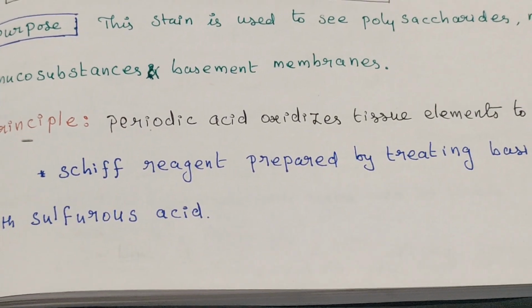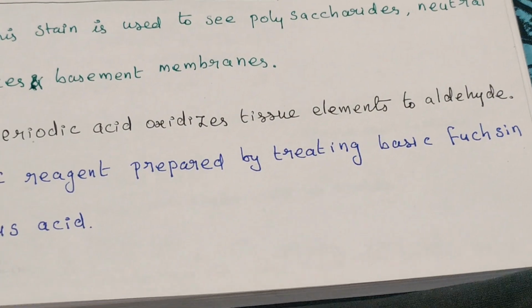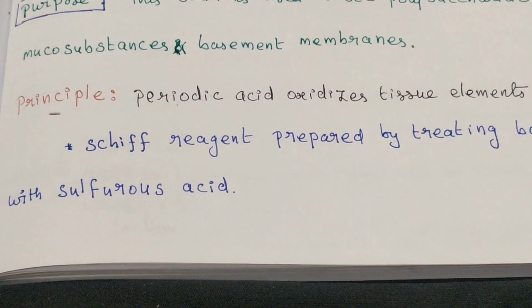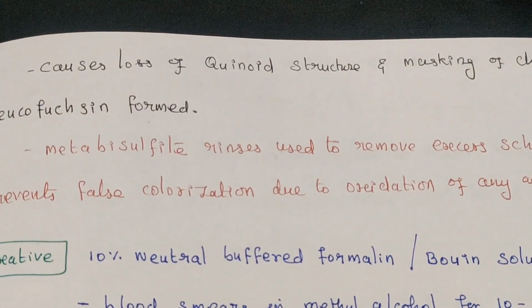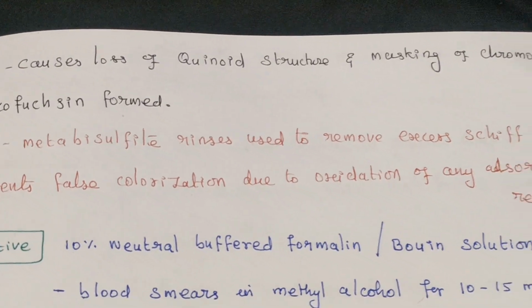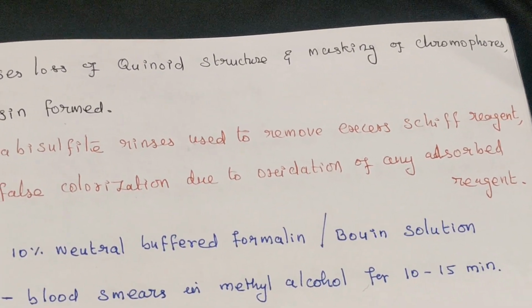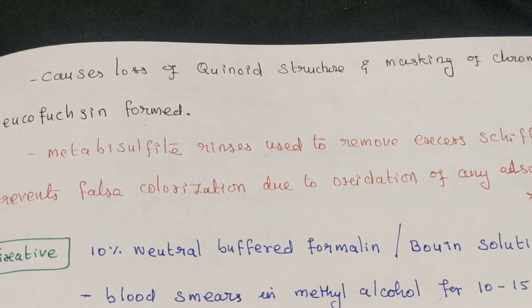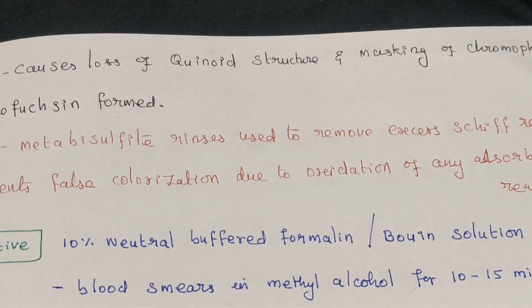Leucofuchsin is formed, which is a colorless compound, and following the Schiff reaction, running water washes cause the visualization of the typical Schiff color.